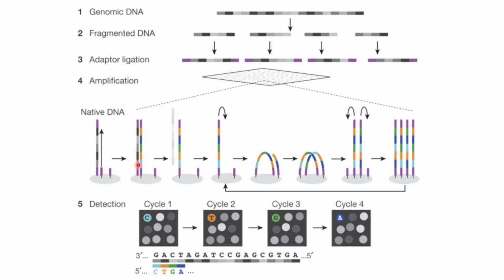This is called a read fragment whenever a particular base is added, and from the insert that is bound to the adapter, whenever a new fragment is formed from the fragment that is attached to the adapter sequence, it is called a read fragment. So this whole length is called a read fragment. Similarly, there is other fragmented DNA with the adapter attached to it; they also bind to the adapters that are present in the flow cell and generate other different reads also. So this is how sequencing works.